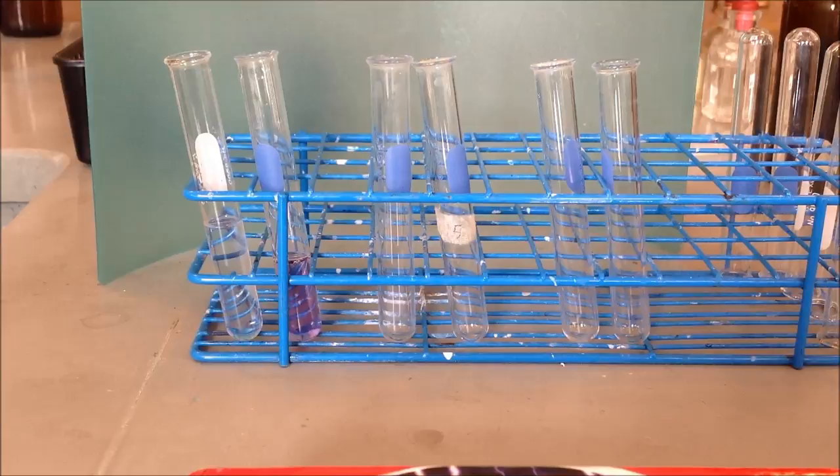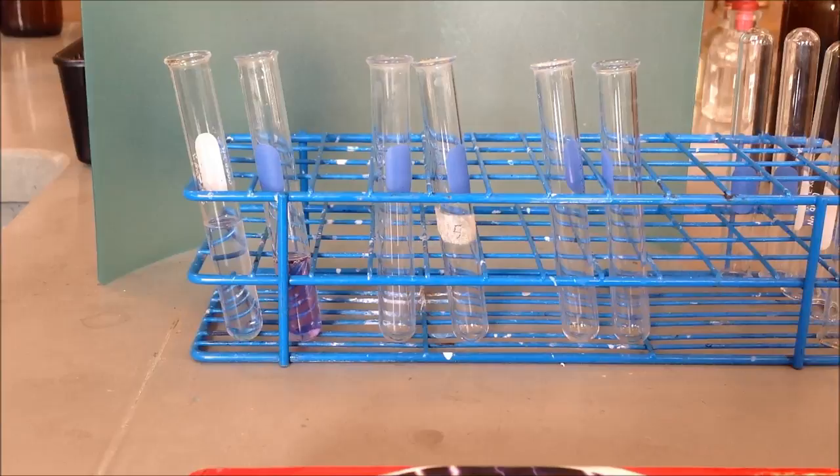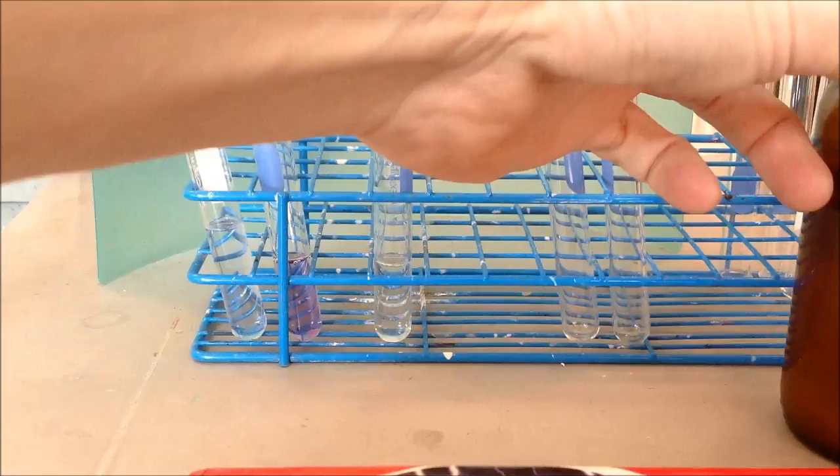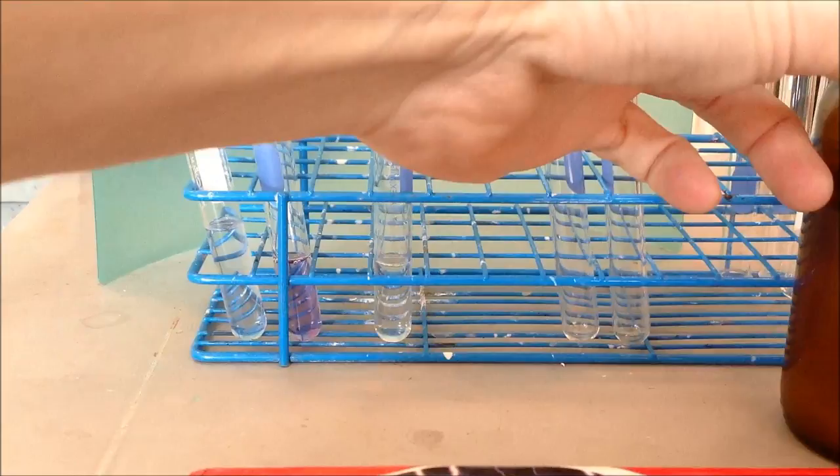The next test we're going to do is for carbohydrates, specifically the carbohydrate starch. We're going to use these two test tubes. Once again, we'll set up one with just water in it. And for the other test tube, we'll put the starch in there that we'll be testing for.